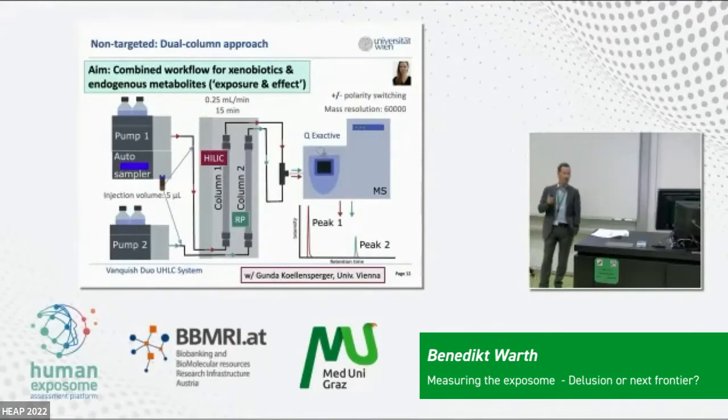And this is a completely novel concept that was never used in this field, where we want to have high throughput. Our ultimate goal is to make technology available where we can measure thousands and maybe someday tens of thousands of blood, urine samples, whatever, and get high quality data. So we need to have faster turnover times.